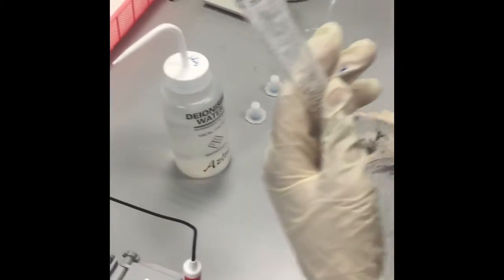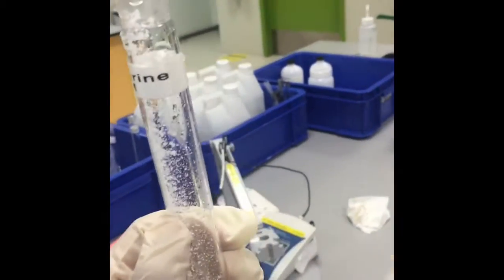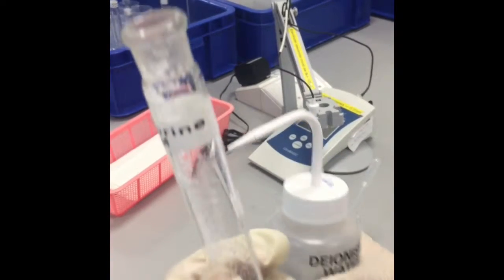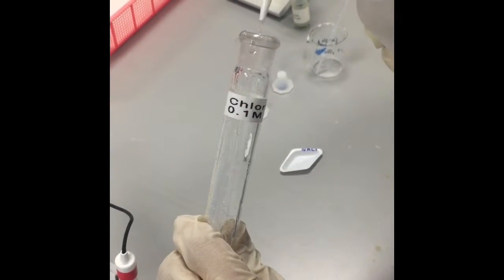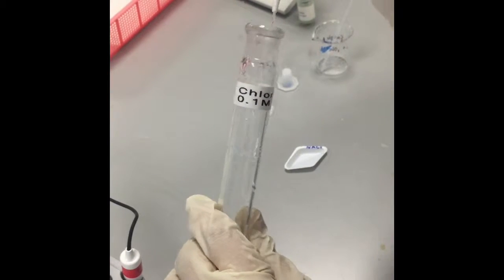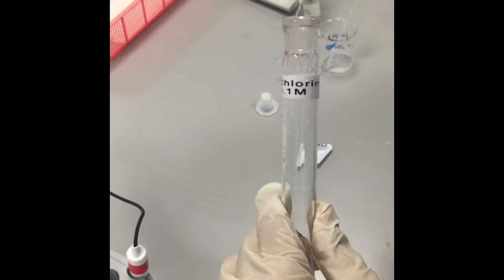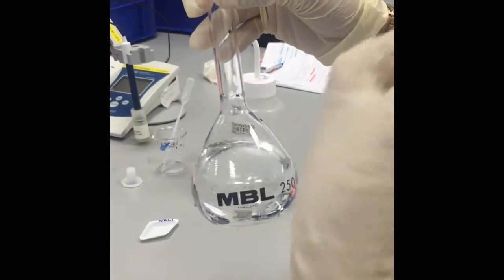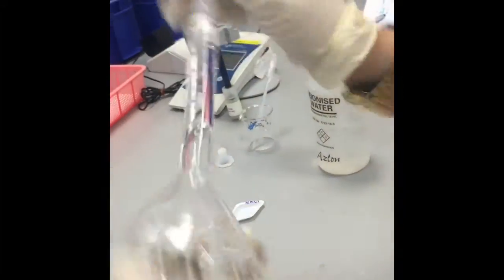As you can see here, fill up the volumetric flask with deionized water until it reaches the mark here. Ensure that all solutes are not stuck at the neck of it, and wash it with deionized water. Next, after filling with half of the amount of deionized water, cap it and shake it, and ensure all solutes are dissolved.